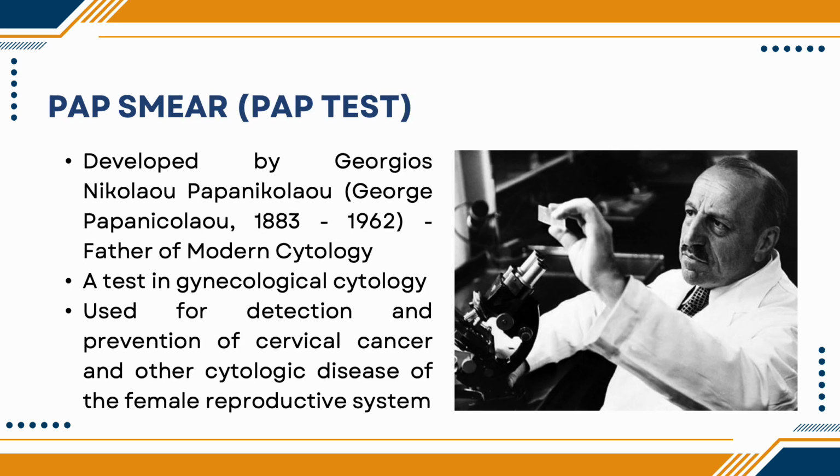So you have pap smear, also referred to as pap test. It was developed by Georgios Nicolaou Papanicolaou, or George Papanicolaou, from the years 1883 to 1962, and he is referred to as the father of modern cytology. So, pap smear is primarily a test in gynecological cytology. Yung mga vaginal, yung mga cervical tissue specimens, they are being stained with the pap stain produced by Georgios Nicolaou Papanicolaou. So it is used for detection and prevention of cervical cancer and other cytologic diseases of the female reproductive system. So primarily again for the detection of cervical cancer.